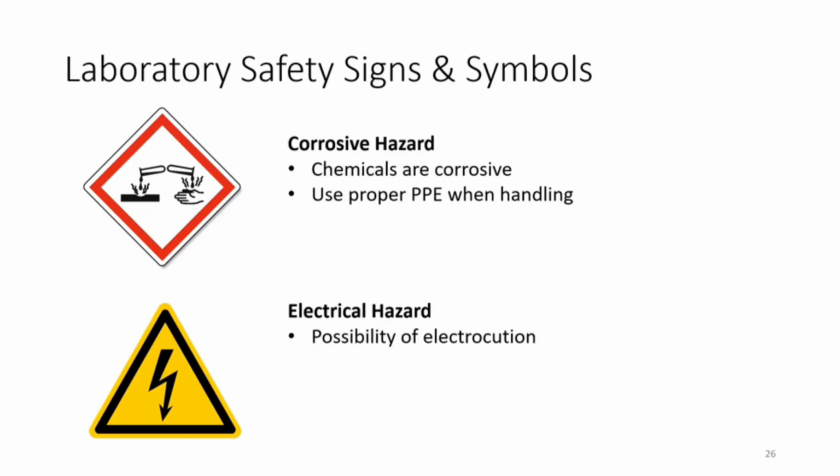Okay, so far I have covered some of the common safety signs and symbols in the lab. Of course, this is not an exhaustive list. In case you see some symbol in the lab which you don't recognize, it's always best to check with your lab instructor.